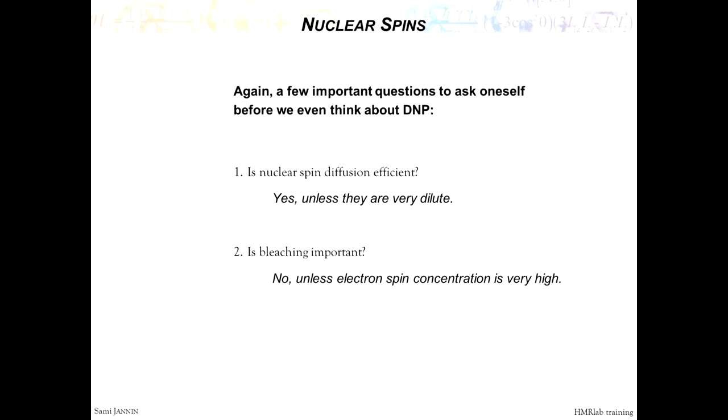I know only one example in the literature where this problem arises. It was to polarize C13 in natural abundance on metabolomic sample with trityl. It seems that it was not working because of that, because there are so few molecules and at natural abundance that there's not enough spin diffusion to nicely spread the polarization on the sample.